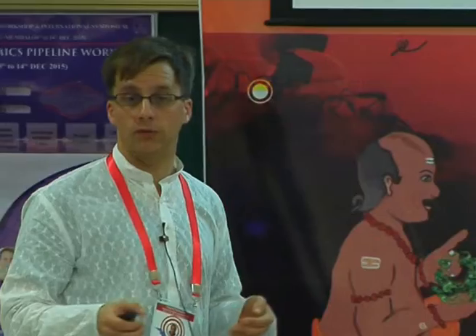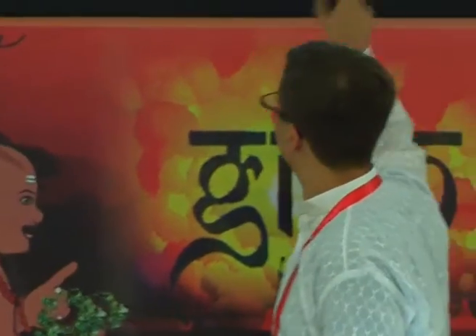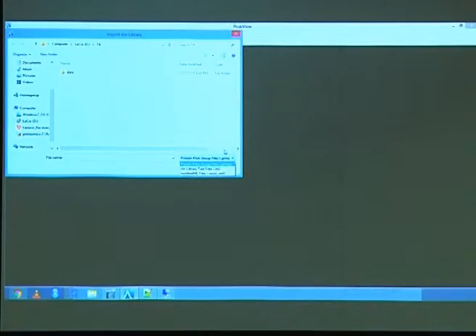I'm going to show you now, assuming you have the library and assuming you have the SWATH files. I just have a trial license, so usually there's a peak here. I don't know why mine doesn't show up, but yeah. You go here to quantitation. There's SWATH processing, and then it lets you choose either a ProteinPilot group file.